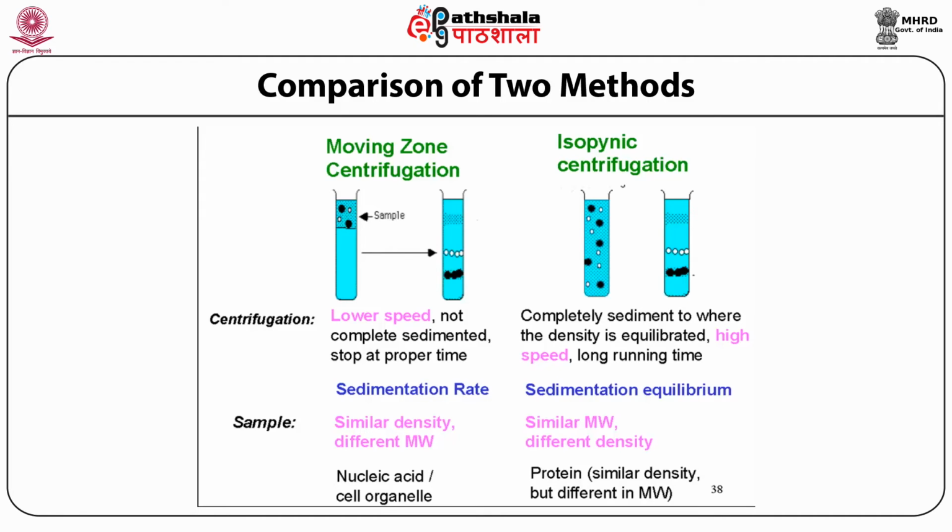For fragile particles, we have to maintain particle integrity by reducing hydrodynamic shear during sedimentation. Therefore, we use rate zonal runs, as a lower RCF is used in the rate zonal run than in the isopycnic run. In a rate zonal run, the duration of centrifugation is more critical than in the isopycnic run. A certain amount of centrifugation is required to achieve isopycnic banding, as if the sample was layered on top of the gradient. Extending the centrifugation time beyond this does not much alter the result.